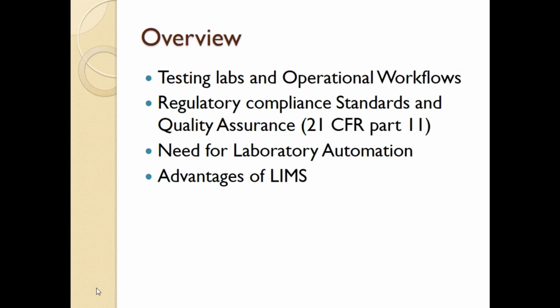The overview or the objectives of this lesson are to discuss the functional operations within the testing laboratory, as well as the operational workflow once the sample arrives into the laboratory, and managing that chain of custody or the workflow throughout the lab. I'm going to talk about the regulatory compliance standards and the QA, the quality standards, specifically the 21 CFR compliance. We'll discuss the need for laboratory automation and the benefits and advantages it brings, as well as the advantages to quality assurance of implementing a LIMS system.